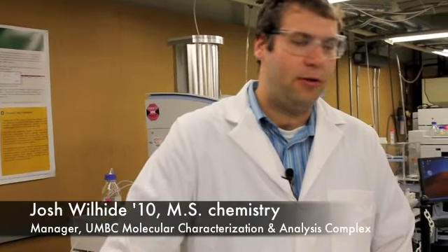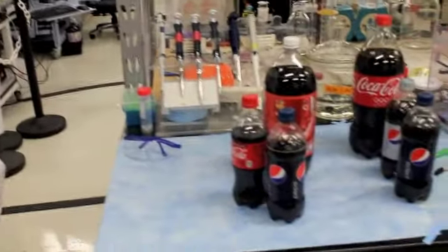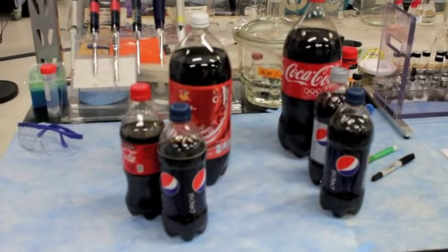Today we're going to show the powerful capabilities of our new ambient ionization mass spectrometer. We're going to be using the instrument to see if we can readily identify the differences between the colas out there, so Pepsi, Coca-Cola, and off-brand Giant Cola, it looks like. We're going to be able to put them up on the instrument with minimal sample prep and get a fingerprint that's unique to the different colas.